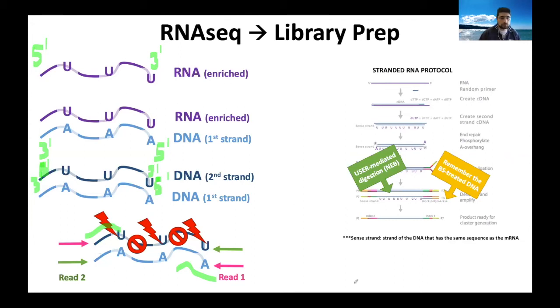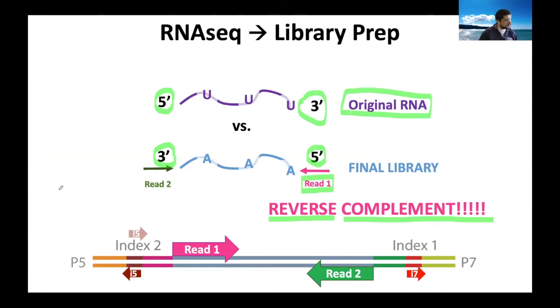And this is particularly useful especially if you're studying viruses, okay? Viruses have a way to compact their genome, and they're usually able to transcribe from both filaments, okay? And so the ability to check the strandedness, or the origin of the strand of the RNA, is really, really useful, okay?